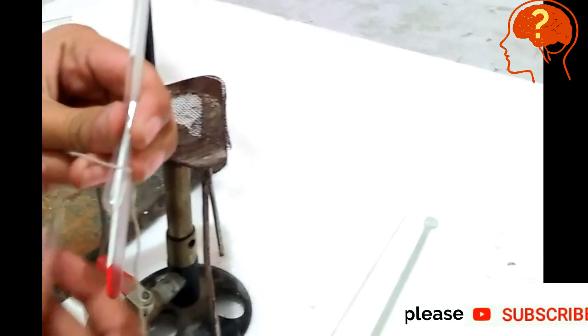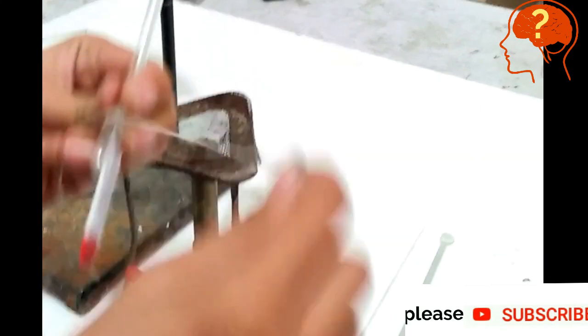Tie up the thermometer with the fusion tube, both the bottoms should be at same level.